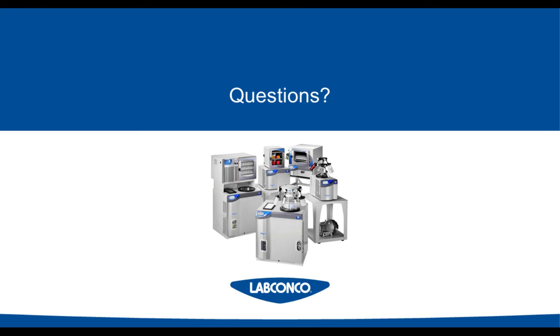Thank you. And does it matter how I pre-freeze my samples? Pre-freezing is actually the most important step of the process. You want to get as much surface area as you possibly can. So shell freezing in flasks is going to be the highest recommendation. If you cannot shell freeze, then slant freezing is going to be the next best thing.